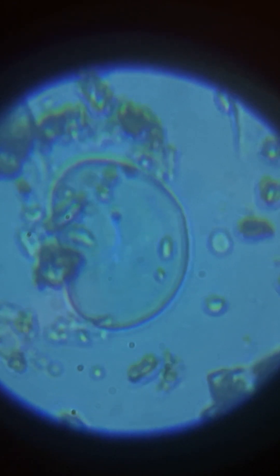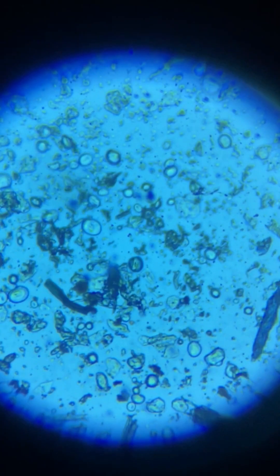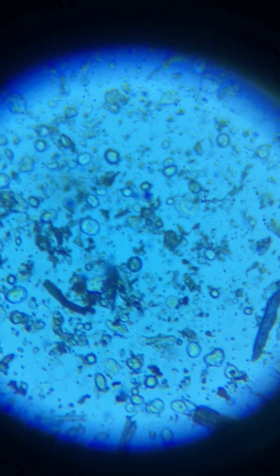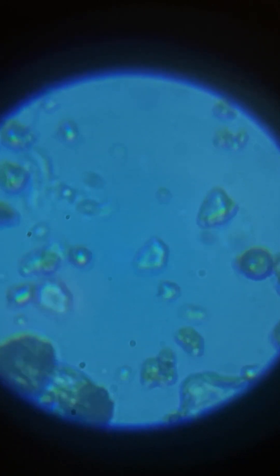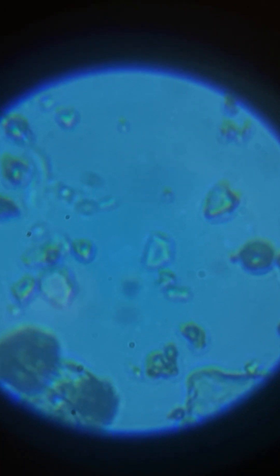It's super lively in here, man. So I'm going to go back to the first magnifier — remember we couldn't see anything? I was like, wow, there's nothing in here. But you can kind of see them move. Let's go back to the second magnifier. Let's go back to the third — this is when we see everybody. Family time. Alright, well you guys saw all the dirt. Things are coming by and staying — for science, baby!